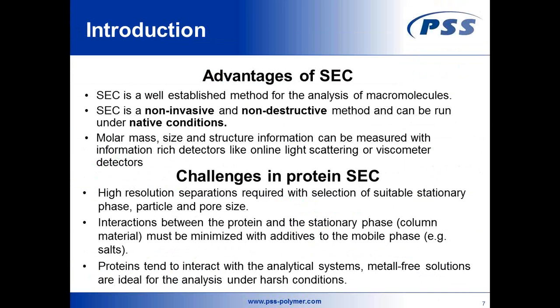our protein, our monoclonal antibody, with the stationary phase. If we are able to separate our polymer or our protein, or the fragments or the aggregates or whatever, only according to size, without any interactions with the stationary phase, then we are on the safe side, and we can gain really reliable results in terms of protein analysis. I have mentioned before, proteins are complex molecules because of the charges they can carry.